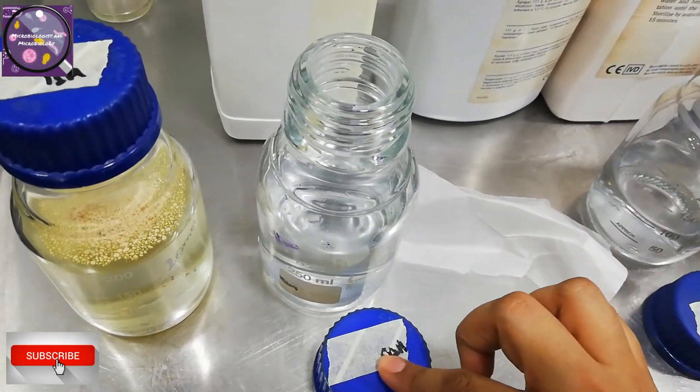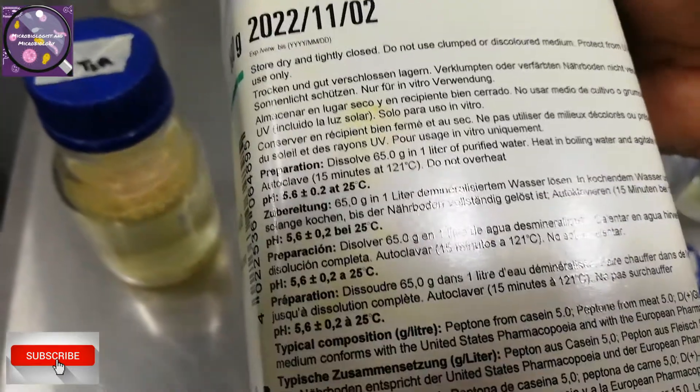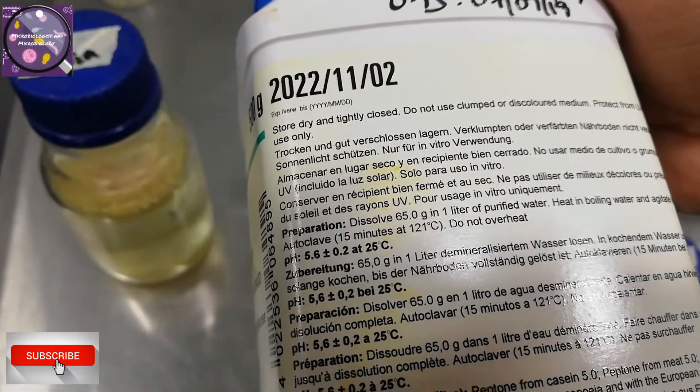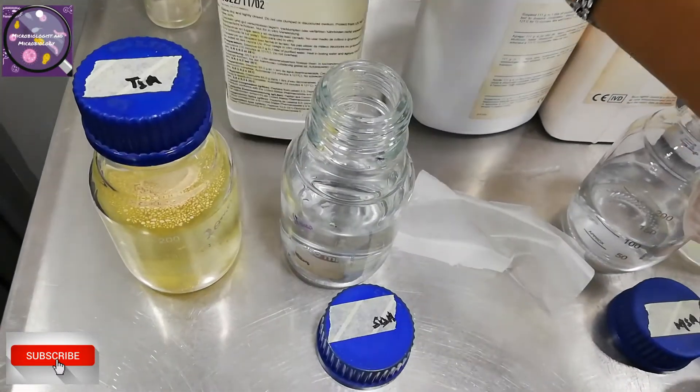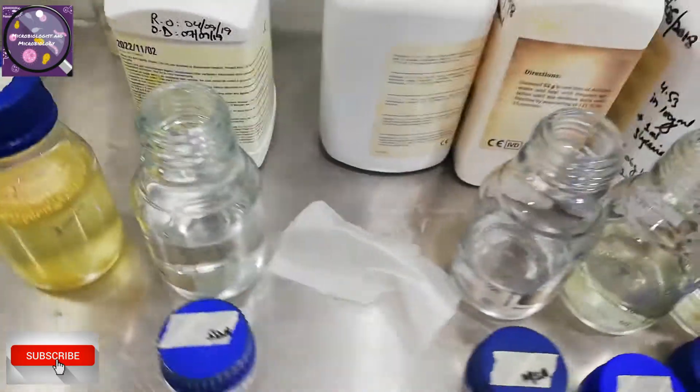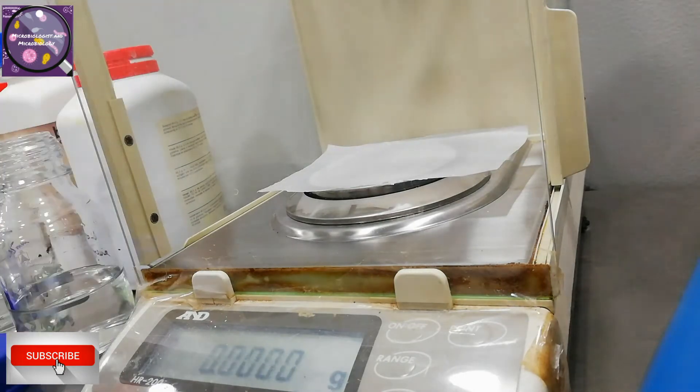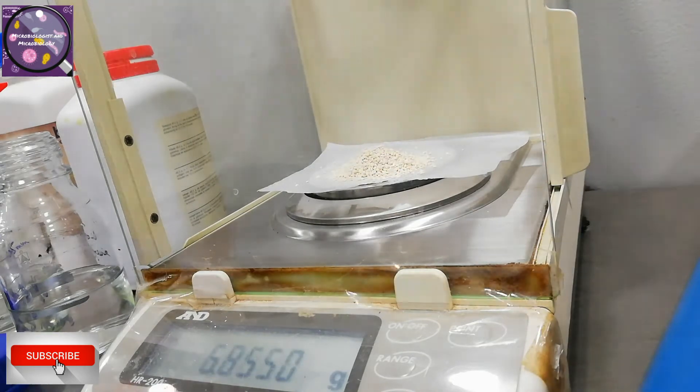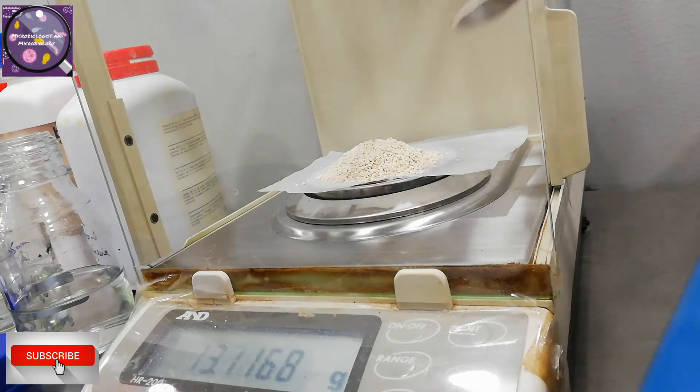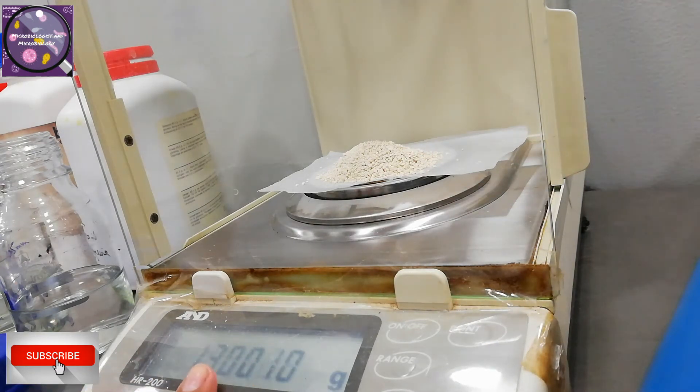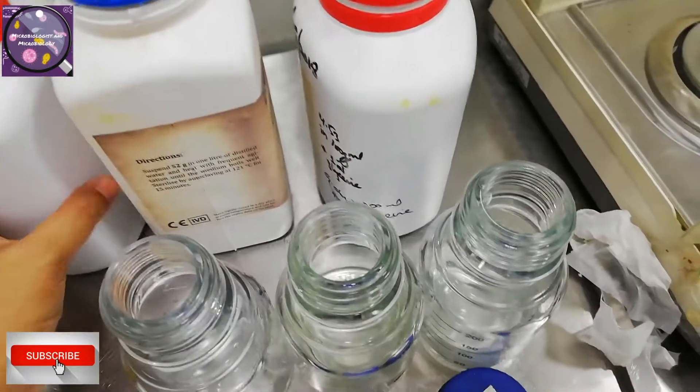Next one is Sabouraud dextrose agar. For this the preparation method is written as: Dissolve 65 grams in 1 liter of purified water, heat in boiling water and agitate until completely dissolved, autoclave 15 minutes at 121 degrees centigrade and do not overheat. As per calculation of 65 grams for 200ml it comes out to 13 grams powder. Now I am weighing the same as I did for tryptic soy agar. Now the 13 grams is accurate and I will put the contents into bottle with 200ml water. For other media preparation I will do the same and will check the back side description to measure the powder.